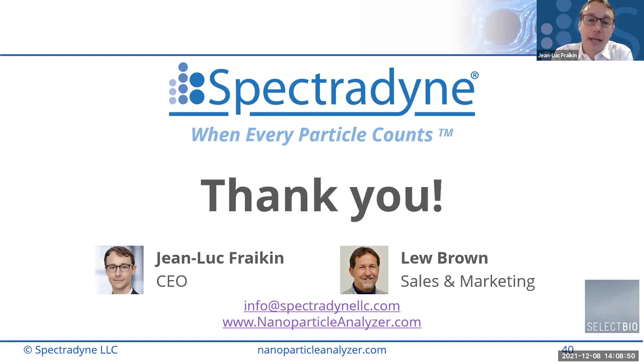And that is a really good question, because it's really easy with dynamic light scattering to compare two samples, because you get a Z average for each measurement, and they might be different, right? I think the important question to ask is what's that really telling you about the differences between the actual samples? And with our technology, it's important to remember that the data that we're giving back is a much richer data set. It's not just a number, it's a whole size distribution. So it's a number at every size in the measured size range.